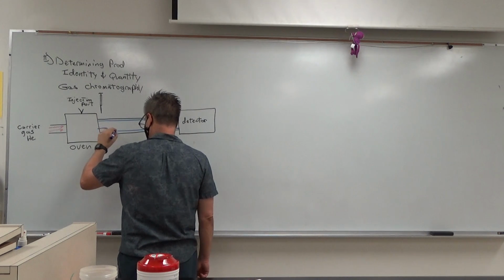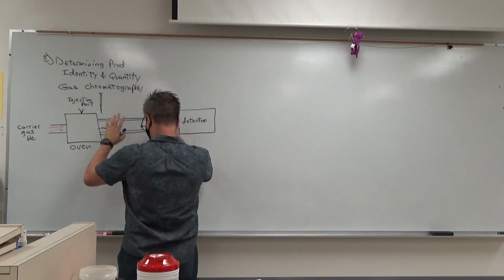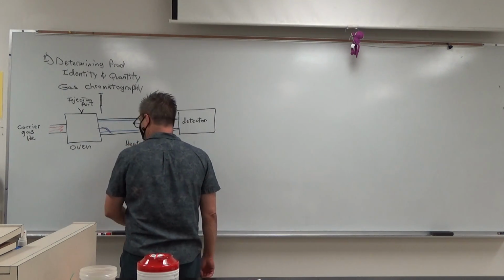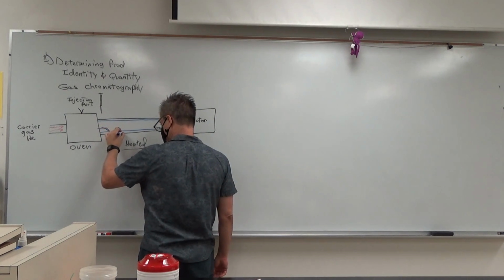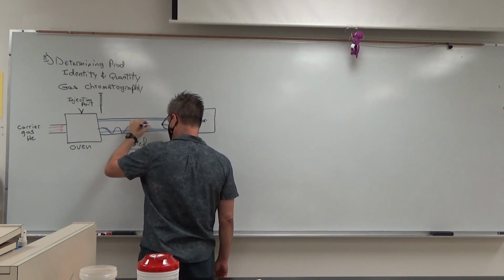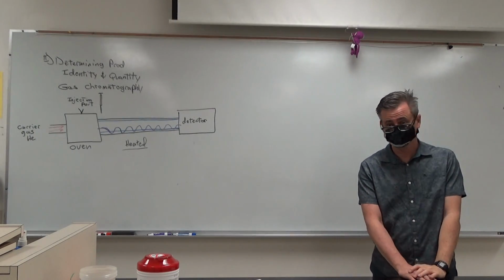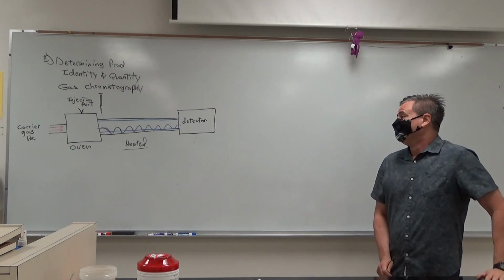Okay. And then, so it gets absorbed. But then, remember, this is all heated as well. It's actually within the oven itself, but heated. So this dude re-evaporates. Gets caught up in the stream, gets going, boom. Gets caught down in there again. Caught up in the stream, evaporate, caught up in the stream, like that until finally it escapes the tunnel and makes it into the detector. That's basically an oversimplification of the principle.